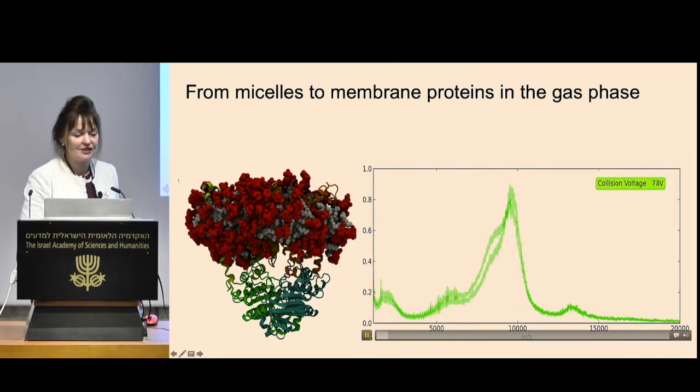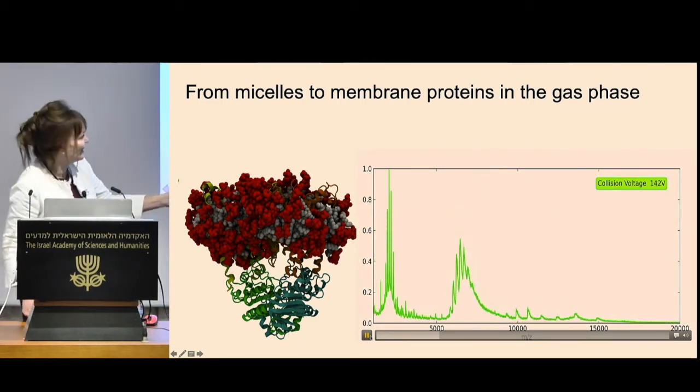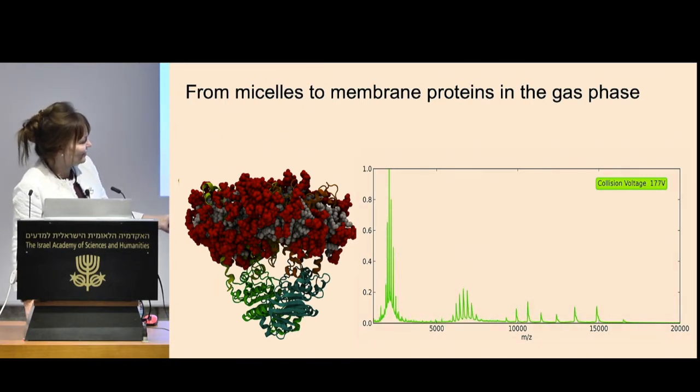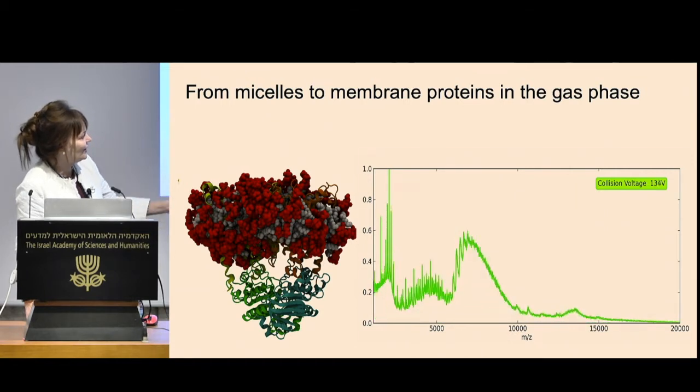So if I show you, this is what it looks like if you were sitting in front of the mass spec, trying quickly to tune it. You'll see you're ramping up your collision voltage here. You're getting out these very nice peaks. And if you overshoot, go too high, it starts to decompose because you've released a subunit. If you get it just right, at around about here, it's intact.